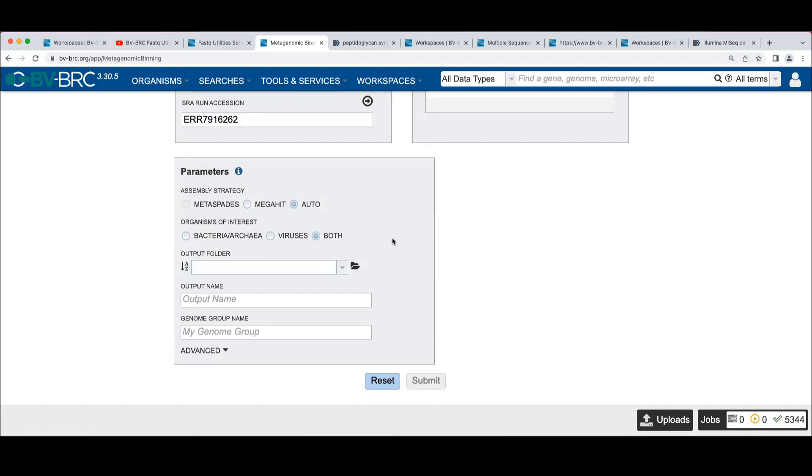And under organism interest, remember back when we looked at the picture, we had these two branches at the end where we did the bacterial annotation and binning and the viral annotation and binning.